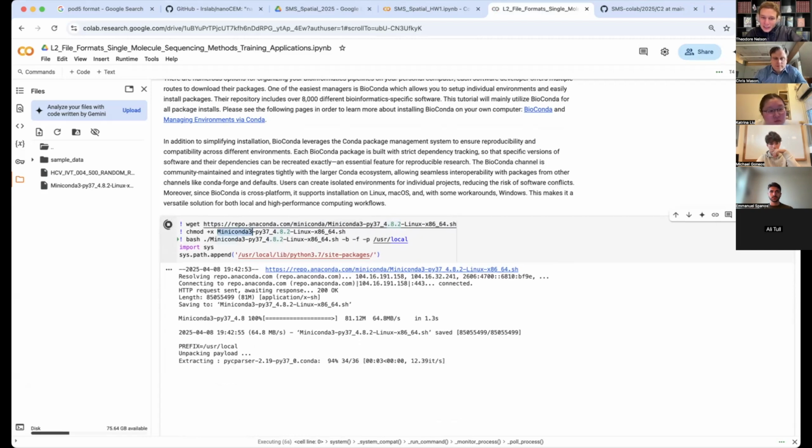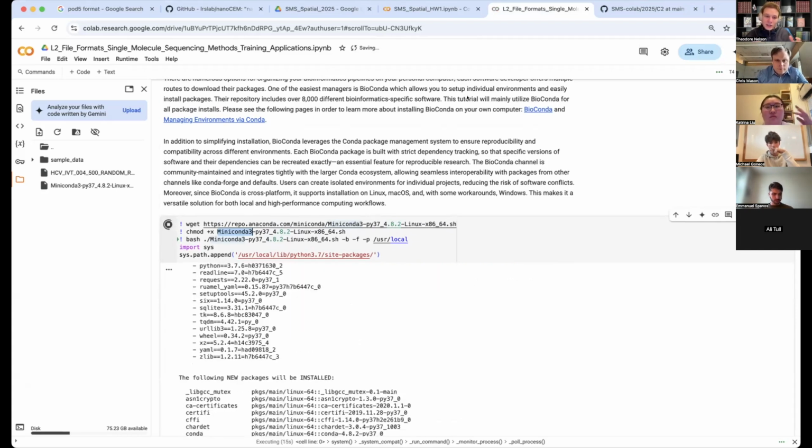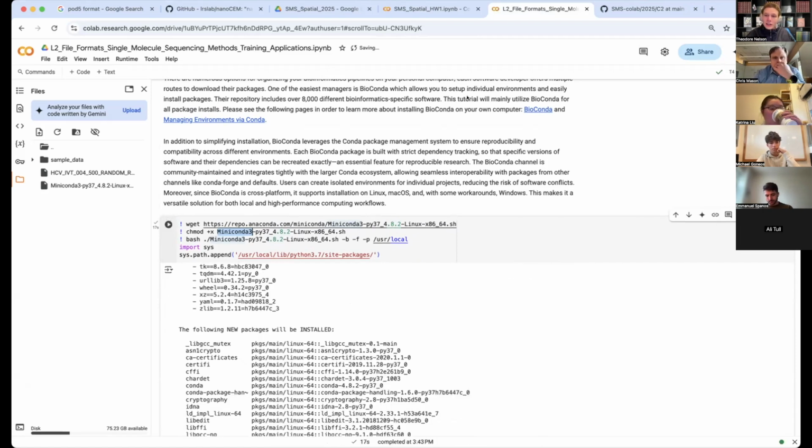You also see that this is called Miniconda. Miniconda is basically a smaller packaged version, so it takes less storage space overall, and it doesn't include any pre-built packages. If you go to the Anaconda website and download their regular Python installation, you'll see that it's got a lot of helpful data science libraries built in, such as NumPy, SciPy, and pandas, all pre-packaged for you to work with. Whereas Miniconda excludes all of that and assumes that whatever you want, you're going to build yourself.